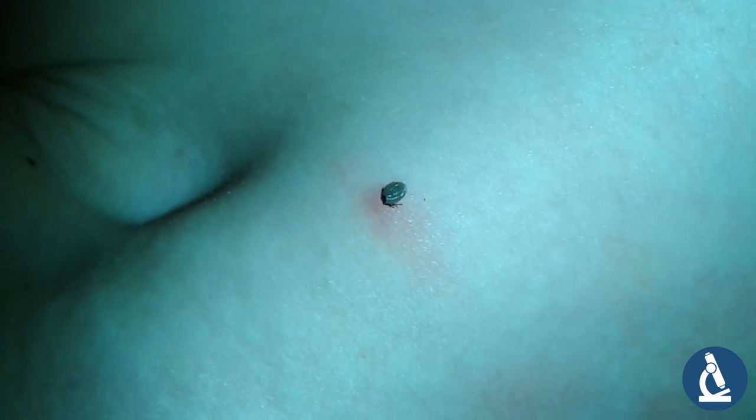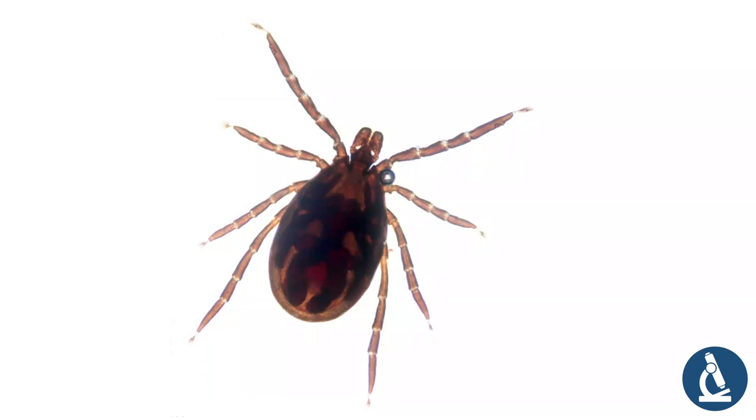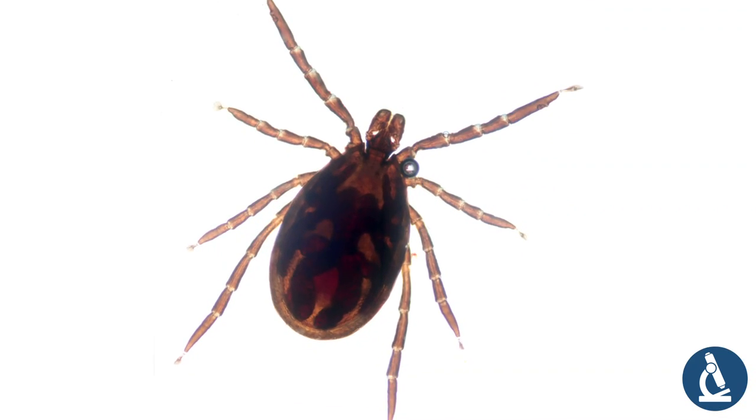So hello and welcome. This little thing in the center is a tick and it's currently sucking blood, and this is how a tick looks like.